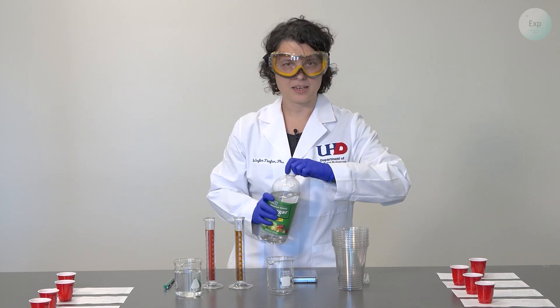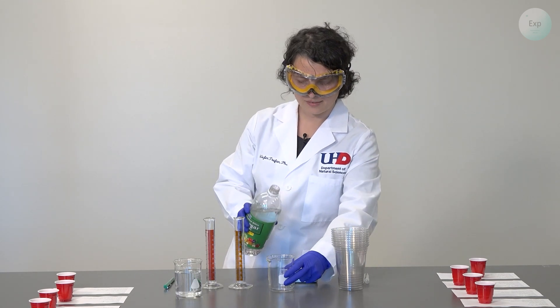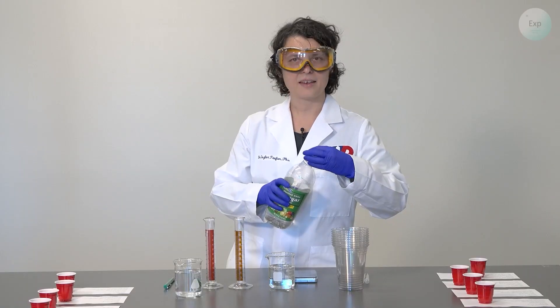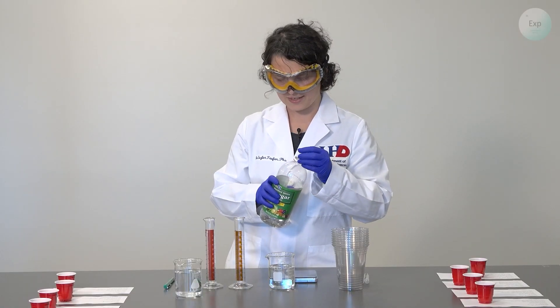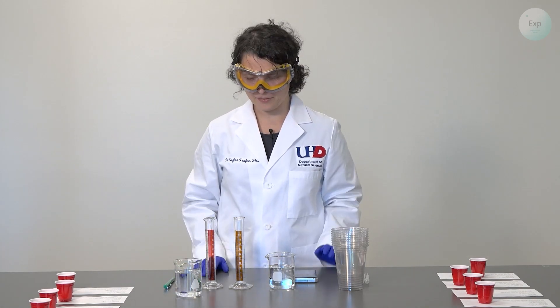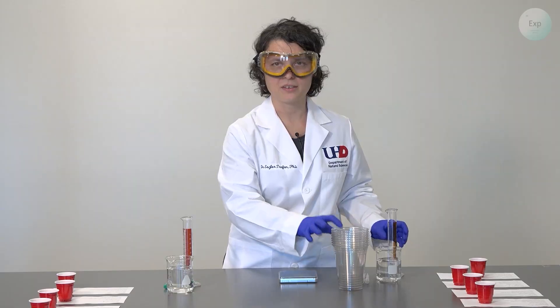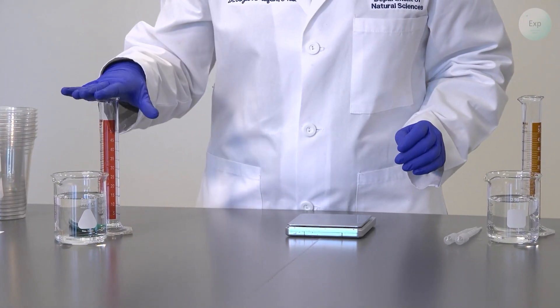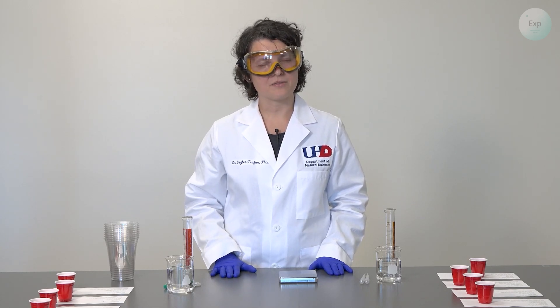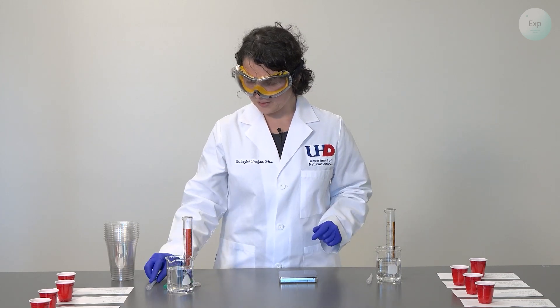I will first pour approximately 150 to 200 milliliters of 5% vinegar into the beaker, and I can set the bottle aside. To make sure I'm not confusing the two, I may label the water and vinegar with Sharpies, or set them on two different sides. Vinegar has a very distinct odor that will separate it from water, and each gets its own pipette.